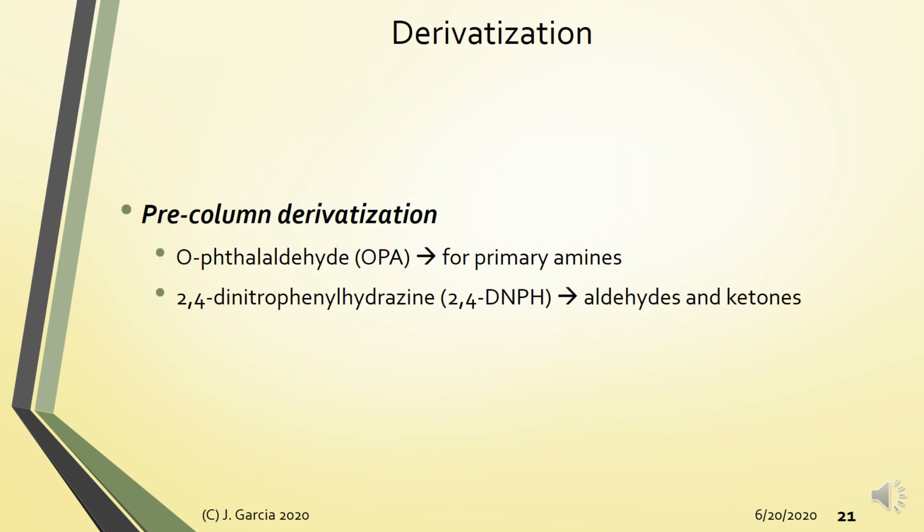Sample preparation methods for HPLC are less tedious compared to your gas chromatography, where you have many extractions. Normally for HPLC, you just need to dissolve your sample. For more complicated samples, maybe you need to digest the sample prior to dissolution. So these are the common sample preparation techniques for HPLC. Solid phase extraction can also be used for HPLC. Derivatization is also an option for HPLC analysis.